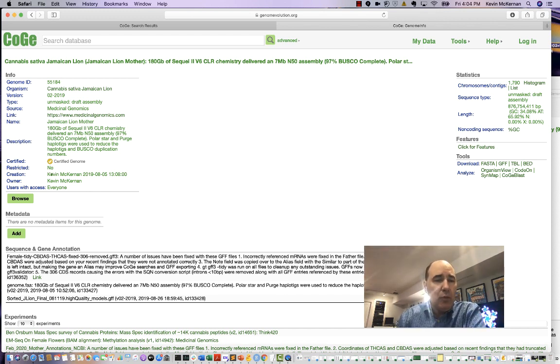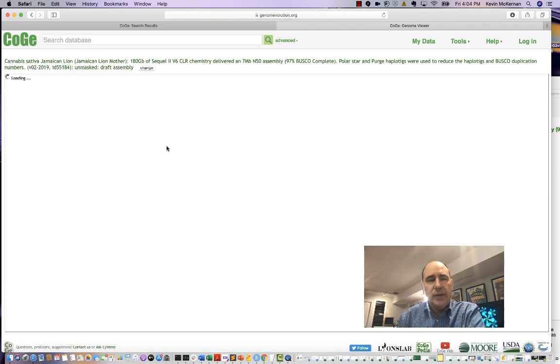Okay, so let's go browse this genome. And this is going to bring up what's known as a genome browser. What it's going to ask you for is, what coordinates do you want to go to? What part of the map are you looking for?